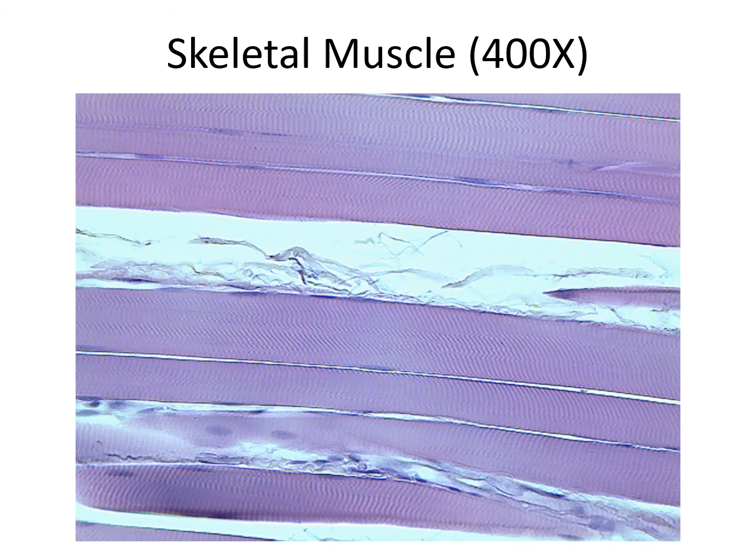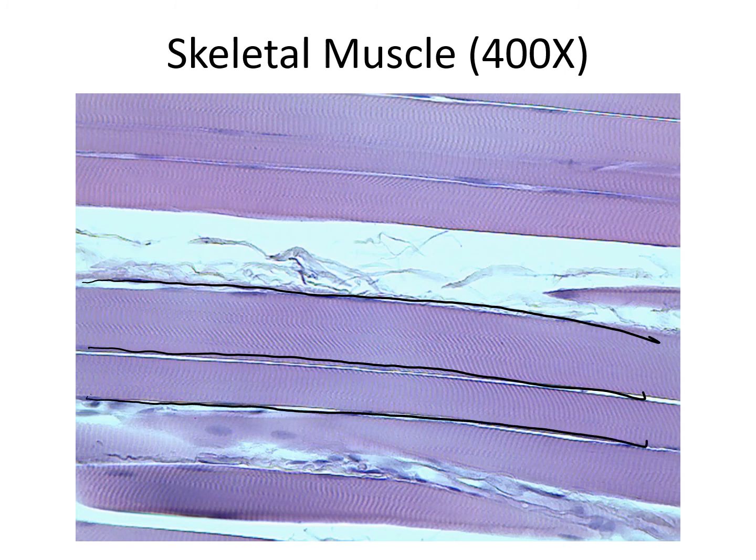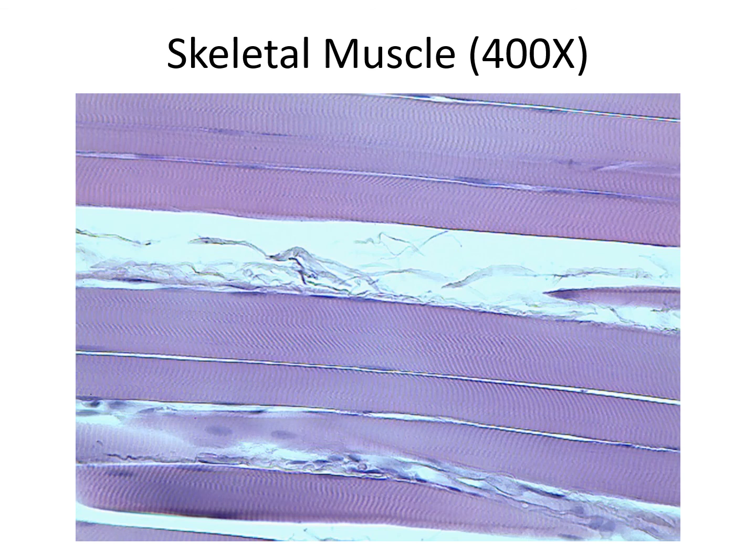Next slide, skeletal muscles. In skeletal muscles, we have this tube-like structure. See, that's a tube. That's one cell. Underneath it we have another cell. Now you see these parts, those are nuclei, and also you see the striation. So here's our striation. Skeletal muscles: tube shape, multinucleated, striated, and voluntary. And what you see in between is some connective tissue.